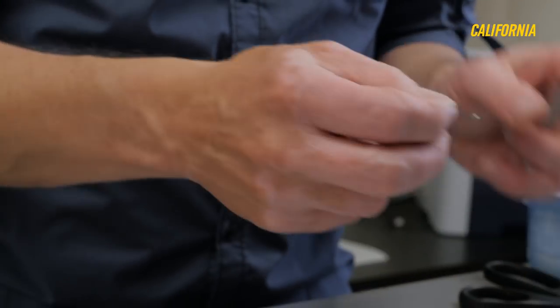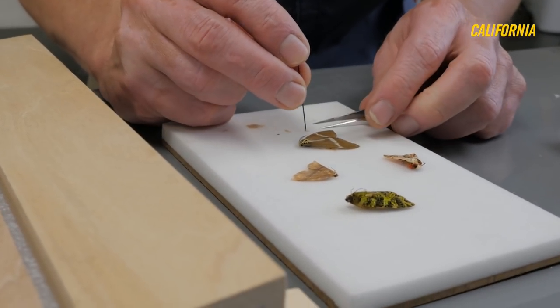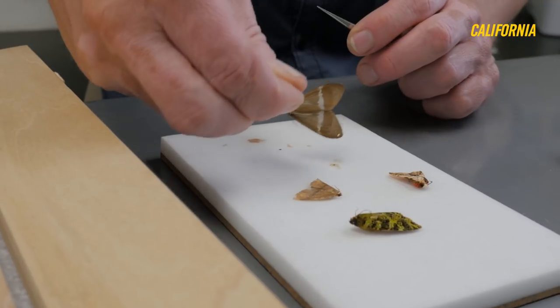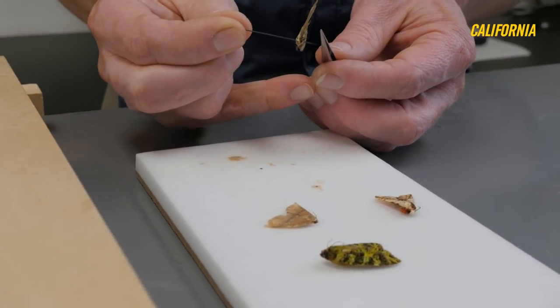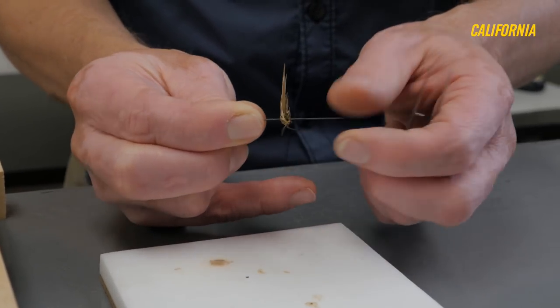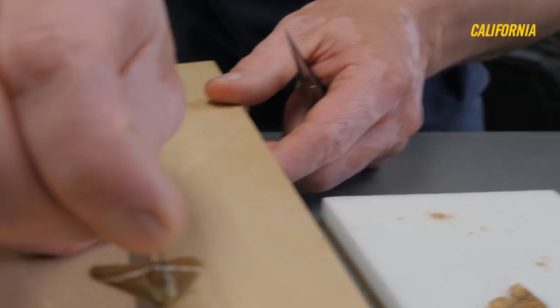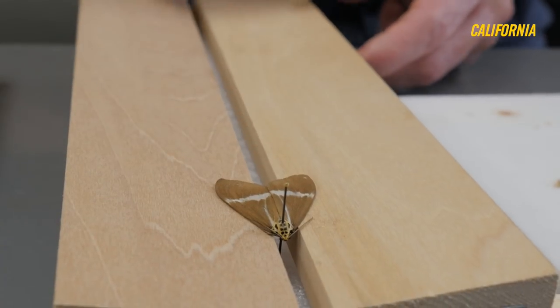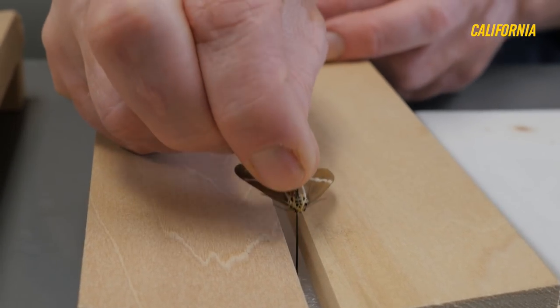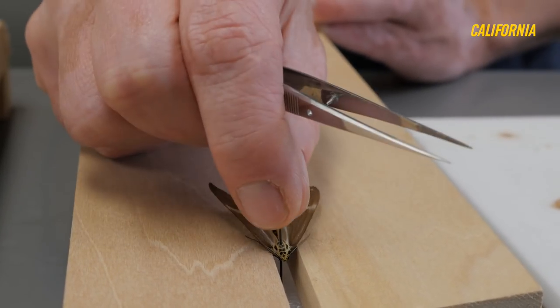These specimens were all collected at the same time. This is the one case where it's okay to put a pin through the middle of the body and not off to the left — it's going to get a pin through the thorax. Make sure that it's perpendicular from all angles, and push it up, leaving enough space at the top to grab onto it. I'll bring it over to my board. I have the groove set so that the body will fit in there, and I'll push it down so that the wings are just resting flat on the board.